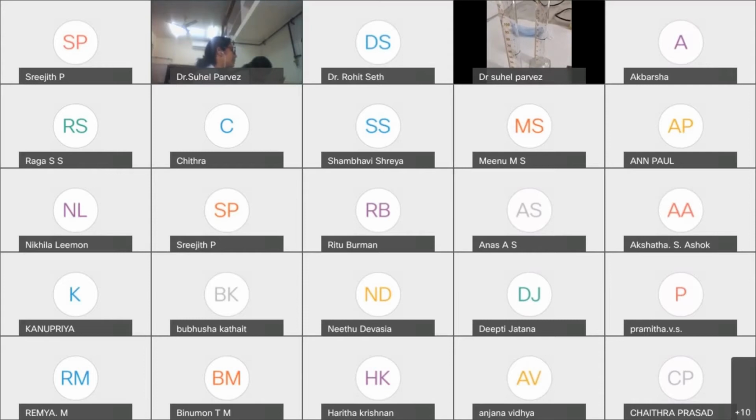This is just for the demonstration. We generally take a number of flies, like 5 flies or 10 flies, but for the demonstration there are many flies. This is how the flies move upward, and we compare the time they take in the control and the diseased fly, and assess how the fly is affected by the protein overexpression and how its physiology changes due to this.